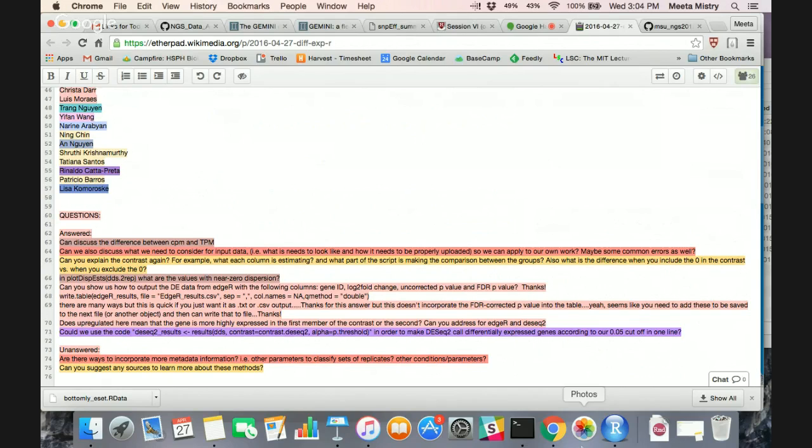It'll come in especially handy when you are doing downstream visualization. So the more columns you add to the metadata table, the more information you have on your samples. You could have replicate information. You could have, for example, if these strains had different genotypes, genotype information. You could have all sorts of stuff, and then you could also model that using these tools. I think there is a limit to some extent, but I'm not entirely sure.